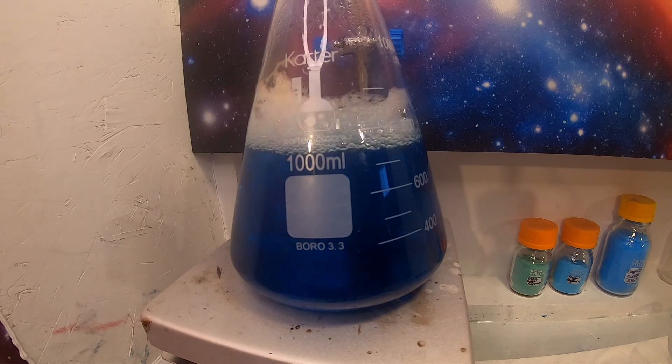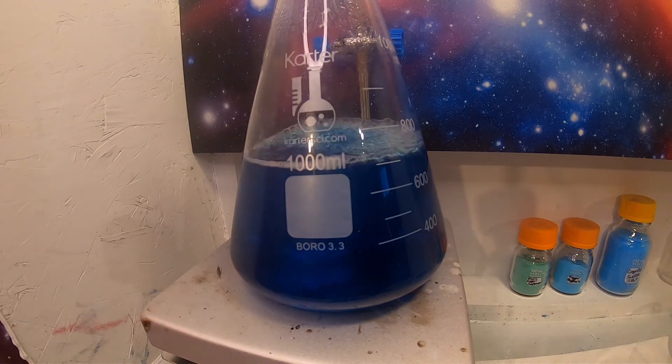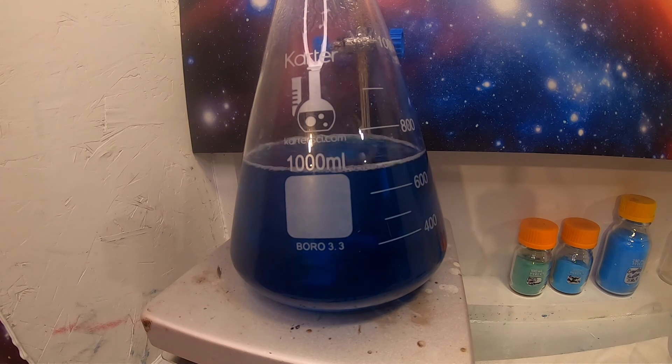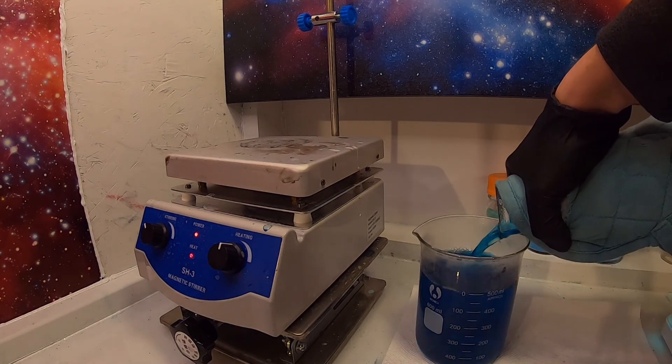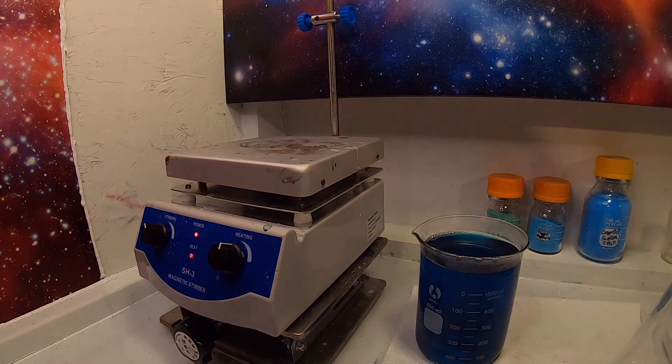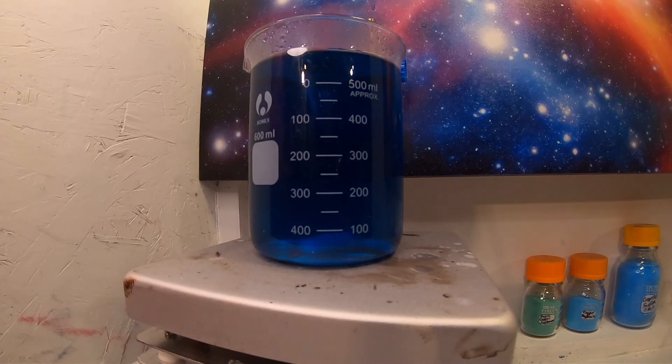Now I must boil off the excess H2O. This is my least favorite part of chemistry. I keep switching to smaller containers to evaporate faster. This is going to take a while.